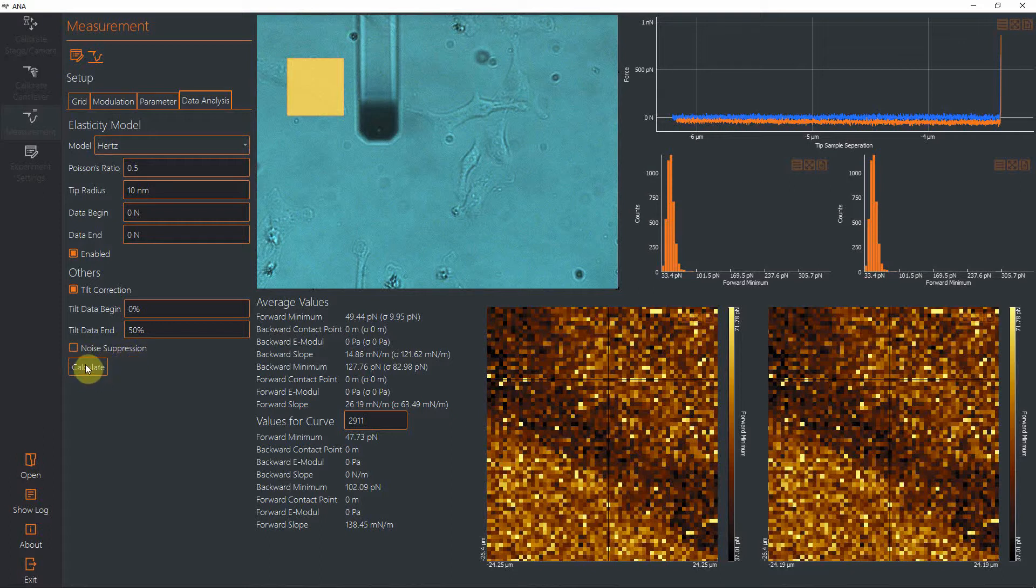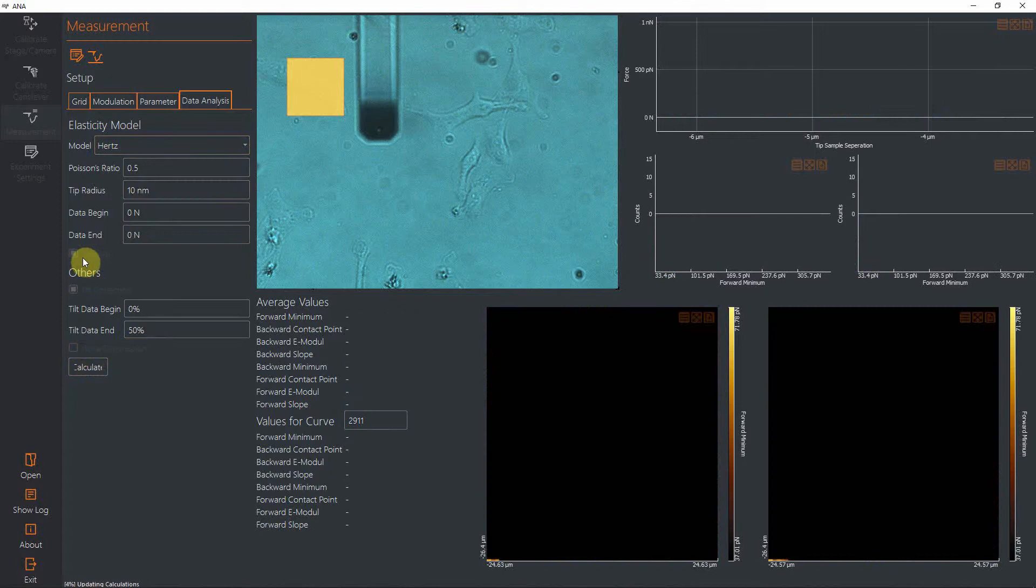If you press 'calculate now' to enable the modulus calculation, you will see down here the progress of the calculation.